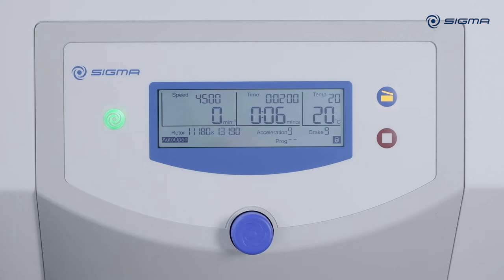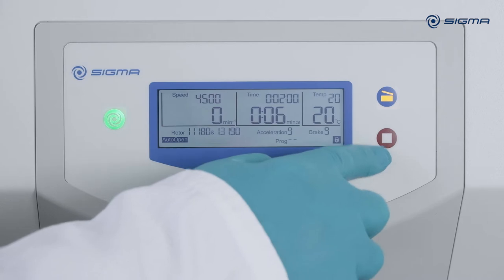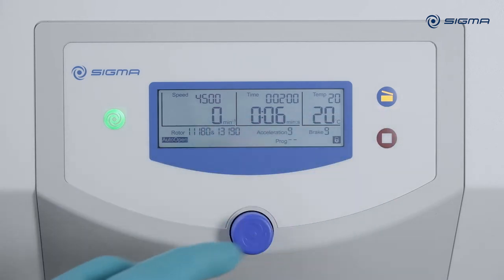The centrifuge controller has just three buttons: for start, stop, and lid opening. An illuminated button has an assigned function.